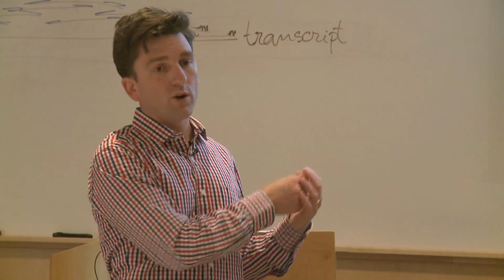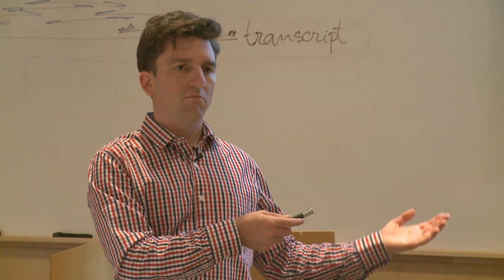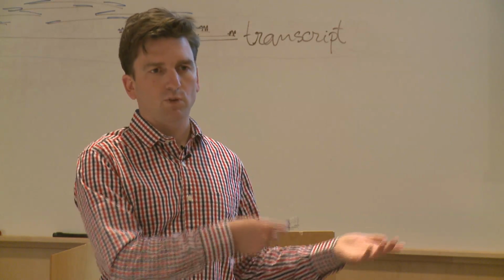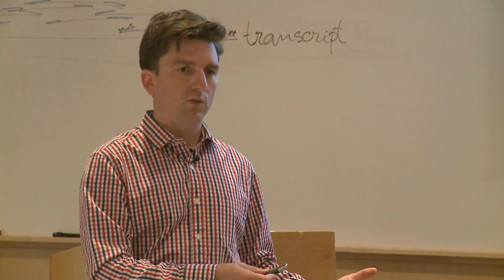But you can run CUFFLINKS and CUFFDIFF and stay at the gene level and say, you know, CUFFDIFF determines that 50 genes are differentially expressed between these two conditions. It's possible. You can also go into transcript level.